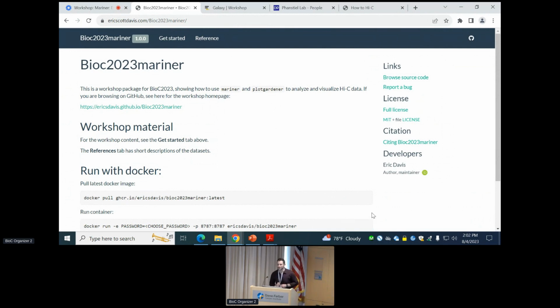Hi, everyone. I'm Eric. I'm a postdoc in Doug Phanstiel's lab at the University of North Carolina at Chapel Hill. And today I'm going to talk about Mariner, which is a package to explore HiC data. I'm going to talk about how you can use Mariner with DESeq2 to perform a differential looping analysis. And then finally, I'm going to talk about the plotgardener package, which was also made by our group, which allows you to visualize your genomic data in a multi-panel figure. So if you're not interested in these things, then you're in the wrong room.